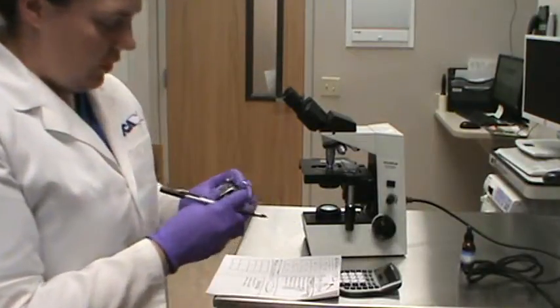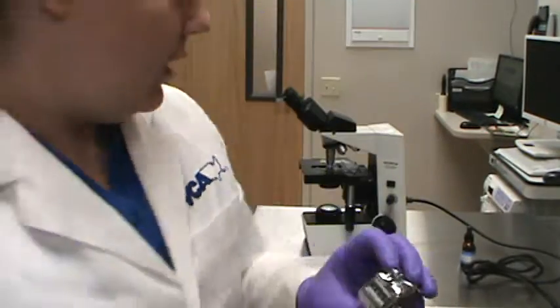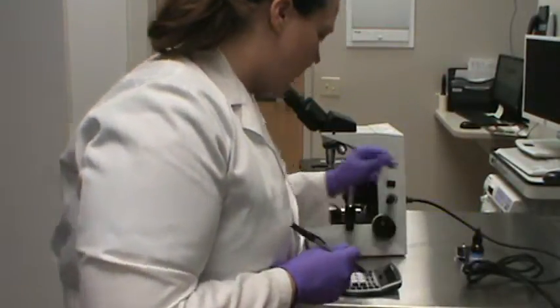So again, we're going to go ahead and reset my counter to 0, just so it's ready for the next person to use. I closed my secondary container of my immersion oil. Just keep that over there as well.